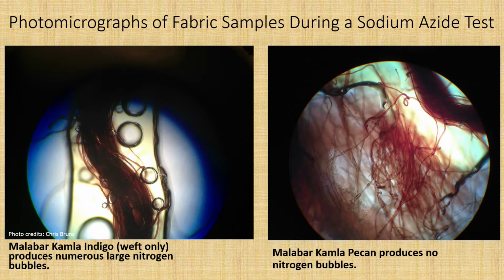More bubbles that are larger and produce more quickly indicate a larger amount of sulfur present in a sample material. As the sodium azide test tests only for the presence of sulfur in a material, it is not adequate to deem a material safe for use with artwork. Effectively, it can weed out materials and allow me to skip performing an Oddy test on them. If a material fails the sodium azide test, it should also fail the Oddy test. If I can avoid having to go through a labor-intensive Oddy test, I can save a lot of time and museum resources.